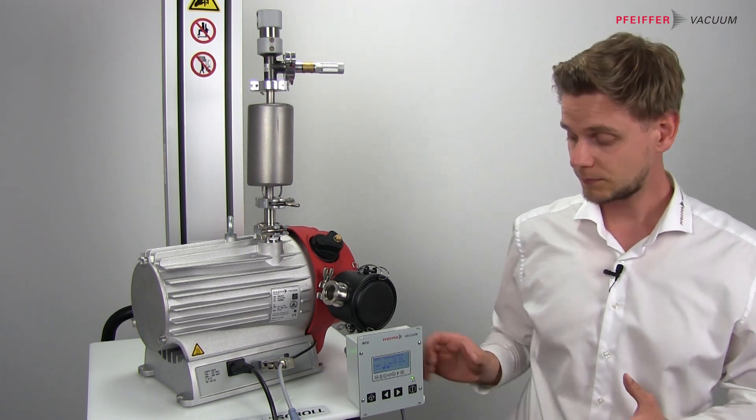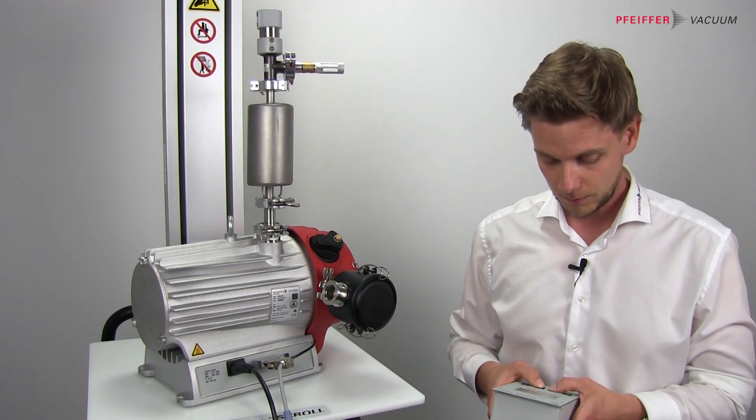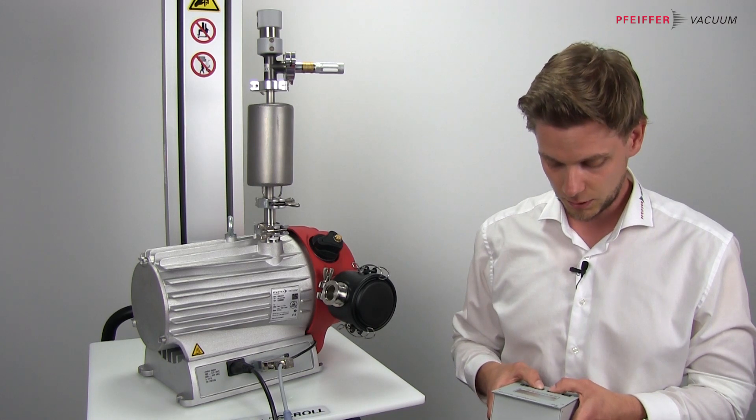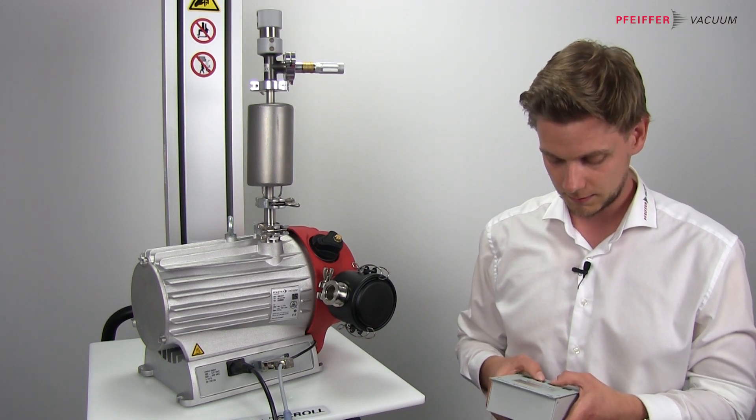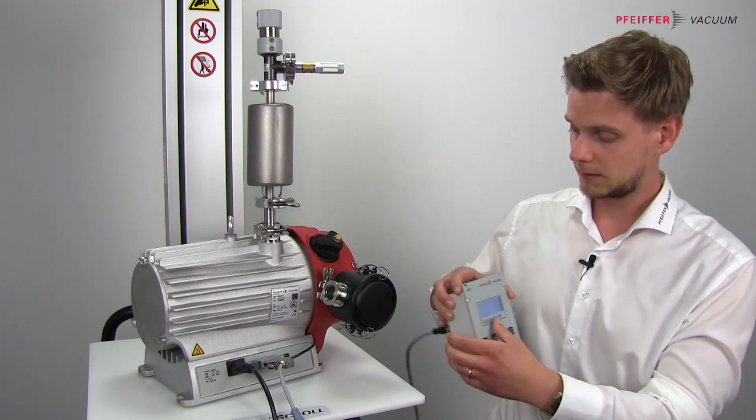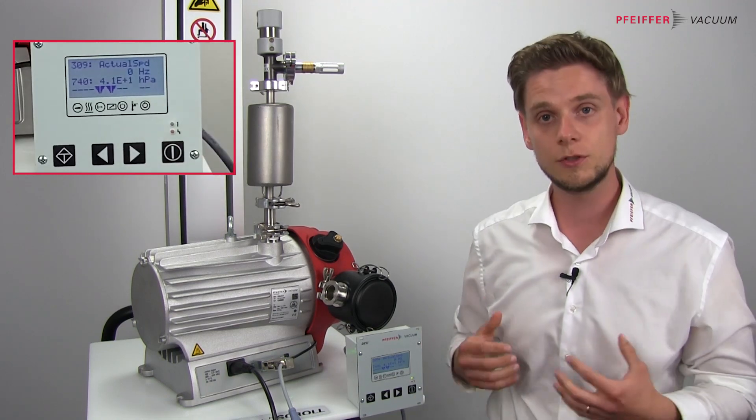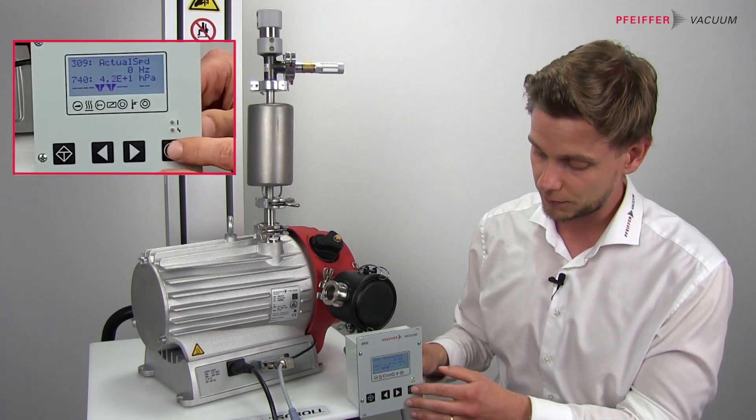Also, I want to show you the auto pressure control. When I activate this, it's parameter 20 I have to activate. I can hold a certain pressure I want to see, in this case three millibar.